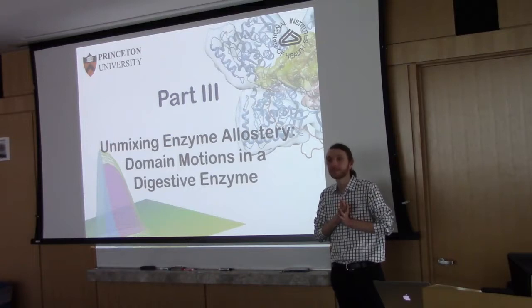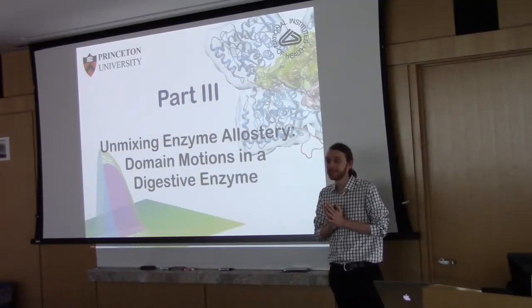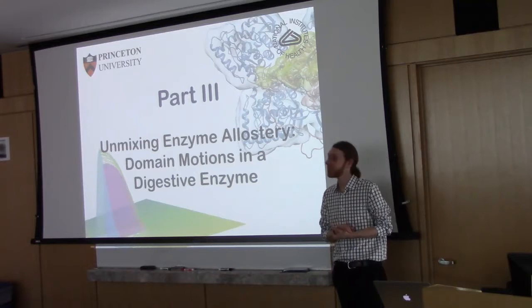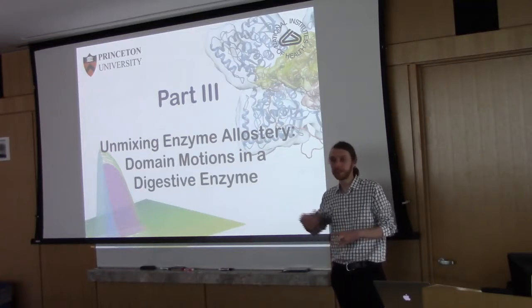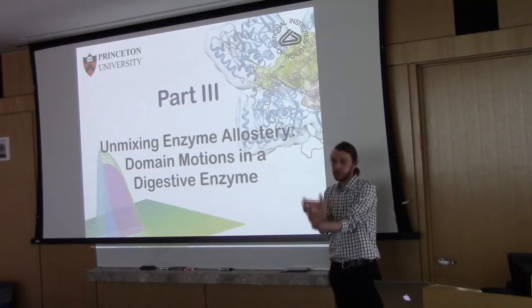Yeah, you should. But you don't necessarily want to do that because it's ambiguous. If you have to, you can, but number one, separate them. That's where evolving factor analysis is very, very useful. In this next part of the talk, I'll mention this evolving factor analysis, which is an extension of SVD that lets us pull out distinct profiles even when the peaks are overlapping.